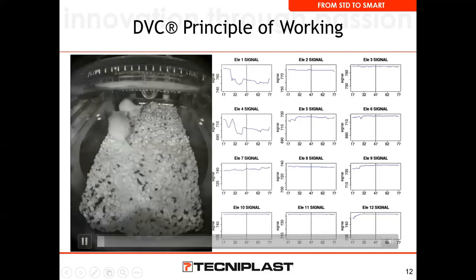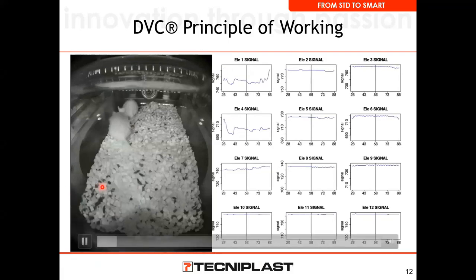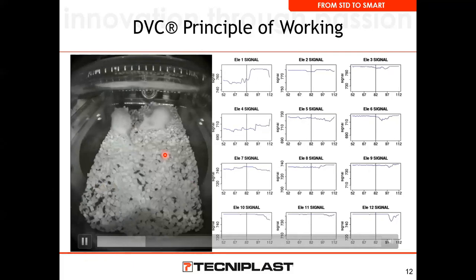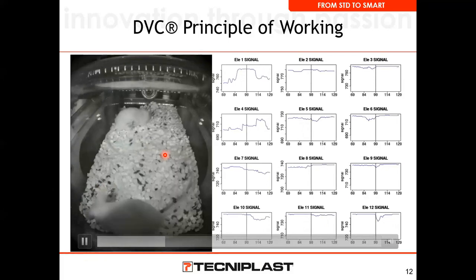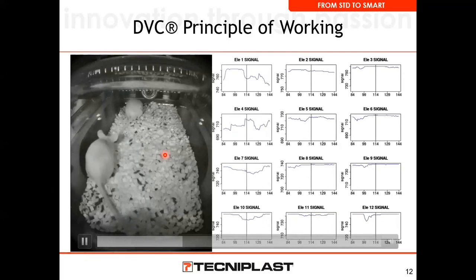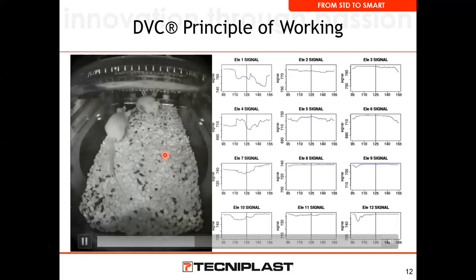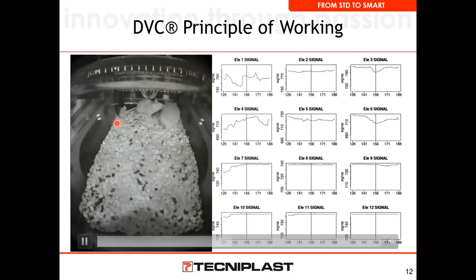Let's get this started. So you can see their movement, and I want you to know too that we just have two mice in this cage. We can have up to five mice in the cage, and it's going to pick up all of their movement in the cage, and it's going to formulate through an algorithm, and that's how we get these signals. And we're going to find out that it's going to be able to detect certain behavior trends that we'll analyze in slides towards the end of the presentation.